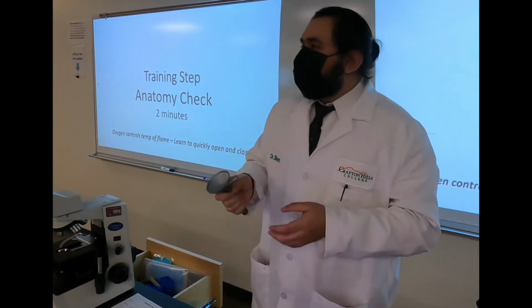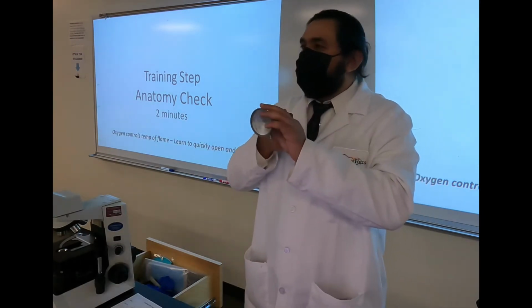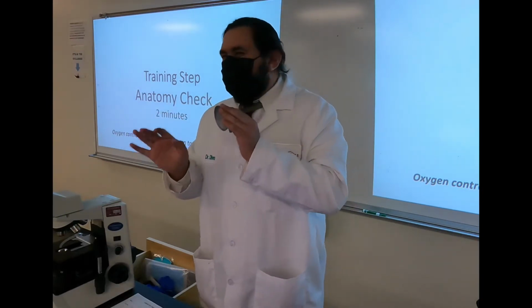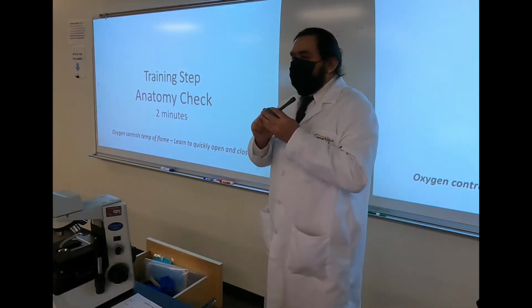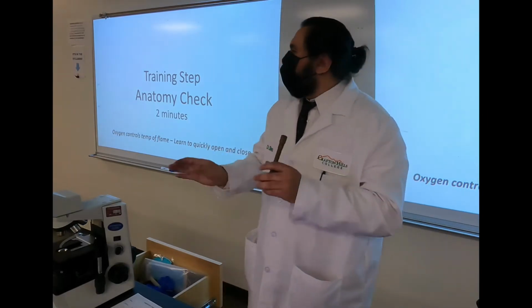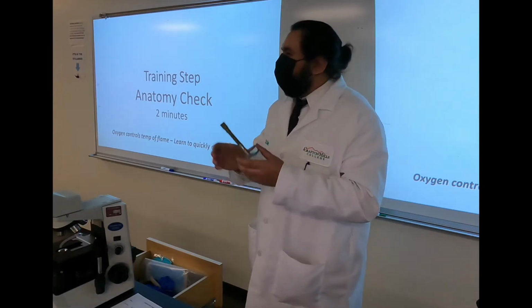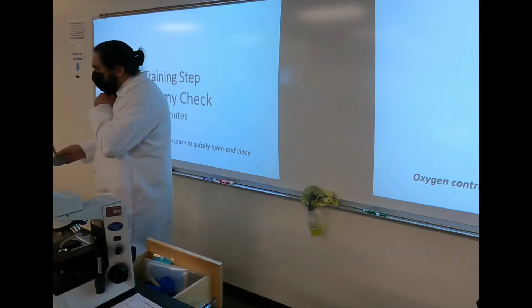Now, if you look at your Bunsen burner on the bottom side, you'll also find another little valve. Really, we don't mess with that guy, but if it's there, that one is a gas intake as well. It will usually control the height of the flame, how much gas is going in. Again, we don't usually mess with that one unless something's going wrong. Just be aware of that. That's all we need to know about the Bunsen burner right now until we start messing with it.